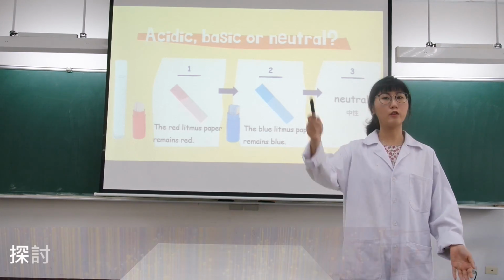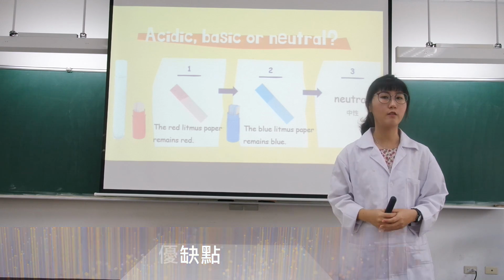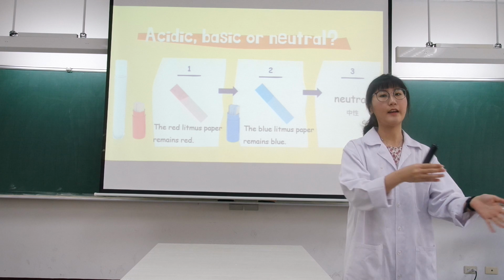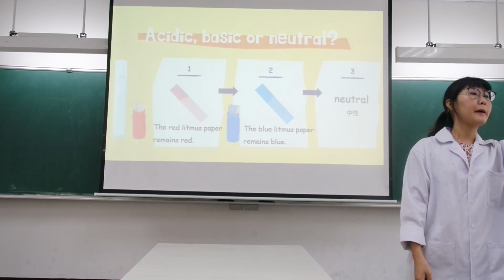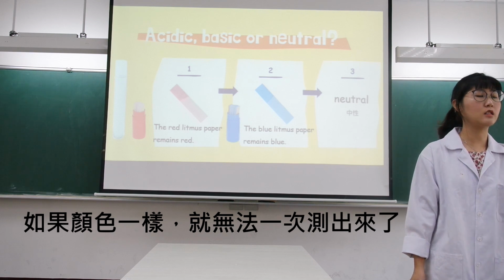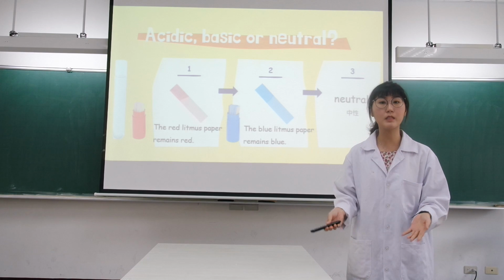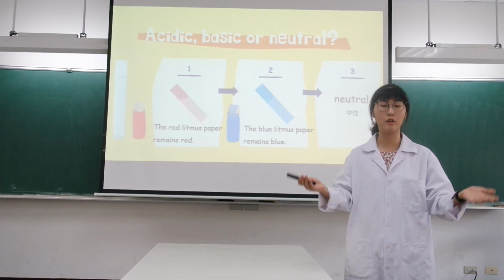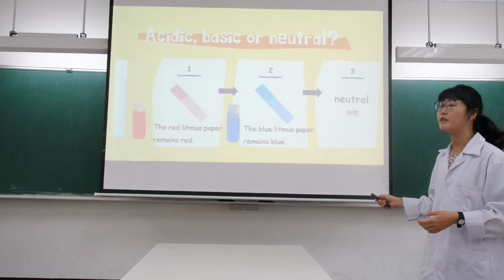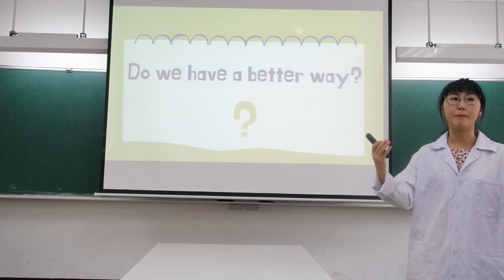Very good. Can you share with me the pros and cons of using litmus paper? William, if the color is the same, we have no way of knowing at once, and we need to use the second litmus paper. Yes, if the litmus paper remains the same color, we need to use the other litmus paper, right? We need to do it twice. Do we have a better way?